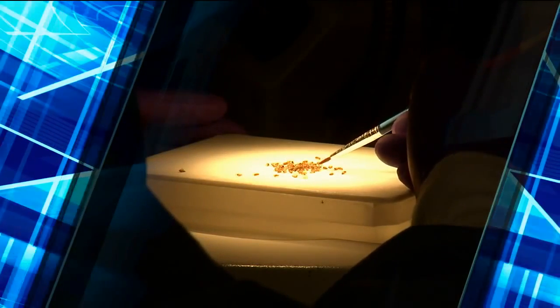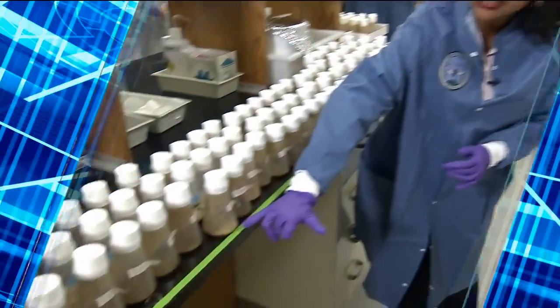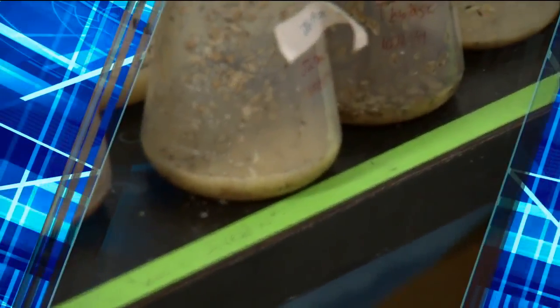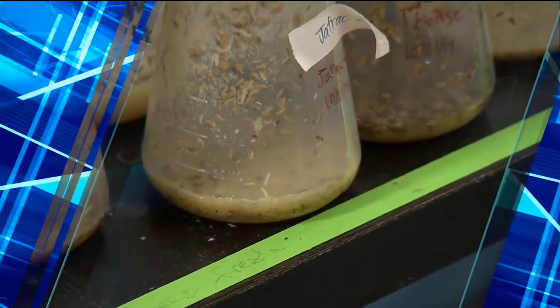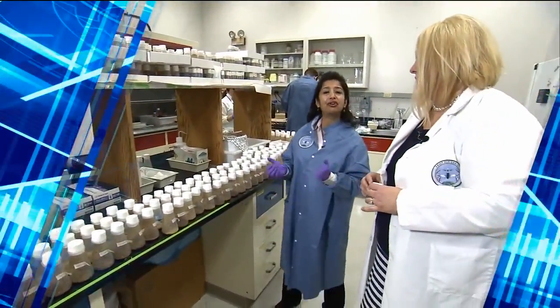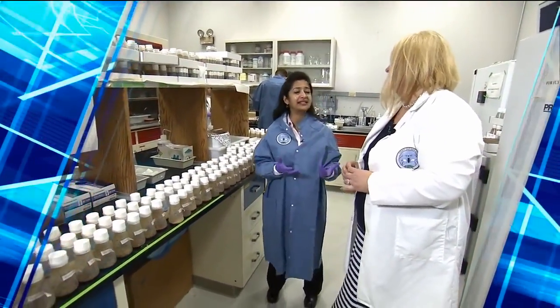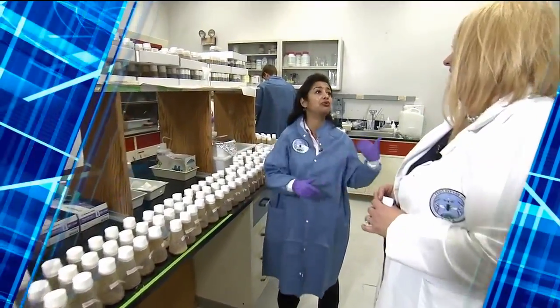So to make copies, we've got to feed them, and that's what happens in here too. Exactly. So this stuff here that you can see is the food. And as you can see, it's a lot of work. So what the team does is that they make the food. You have to give them food regularly. Unlike if you're working with, say, bacteria or yeast, you don't want to work with them for a while, you put them in the freezer and they're good to go. And then when you're ready, you come back and you revive them, right? You can't do that with flies. You have to constantly keep them alive and give them food till you're ready to use them.